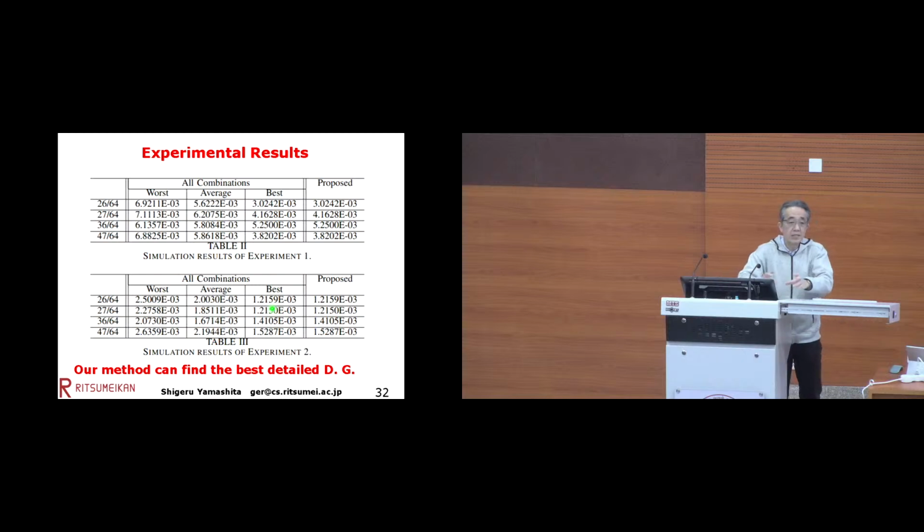But there is another type of device which is called MEDA. Then they can move not any volume, but many types of volumes. So 1 by 2 can be mixed or something. So maybe that's interesting to consider that device. So, not sure.